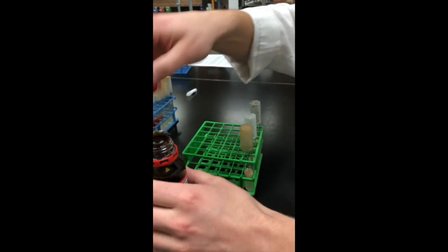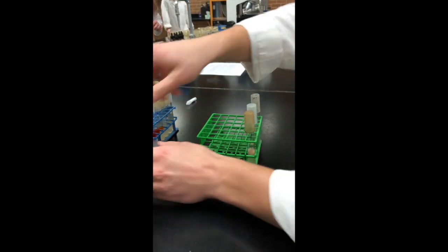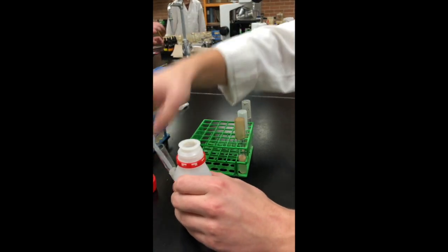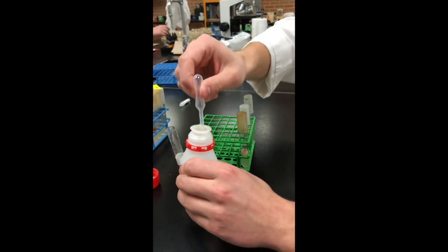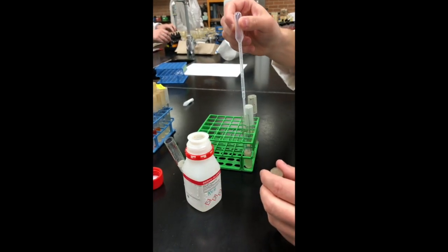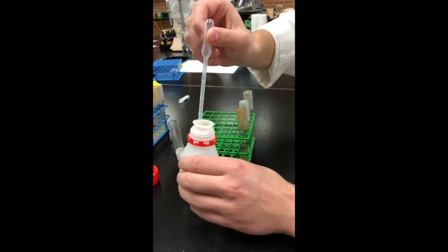So we've added our alpha naphthol. Now we're going to add our 5 drops of KOH, or potassium hydroxide. Notice when we add it, the media starts to clear back up.